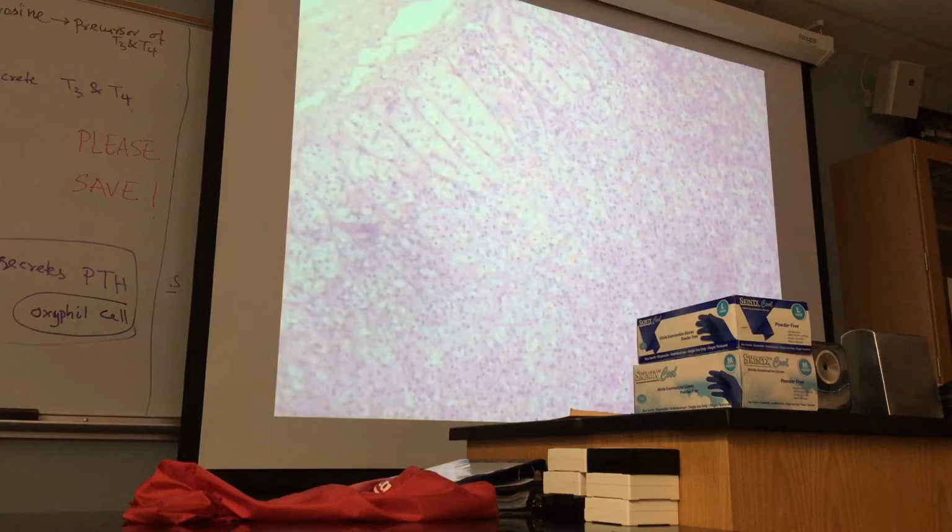If I ask you to name a hormone secreted by this region, what do you say? Cortisol, okay? So, if I ask you to identify the region, as indicated by the pointer, what are you going to write? Zona glomerulosa. If I ask you to identify the region, what are you going to write? Zona fasciculata. The cords of cells, fascicles of cells, are very compact.